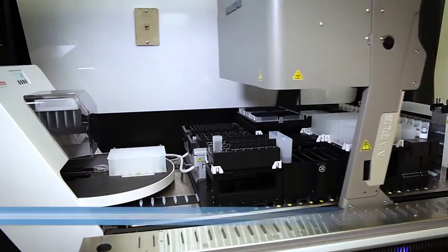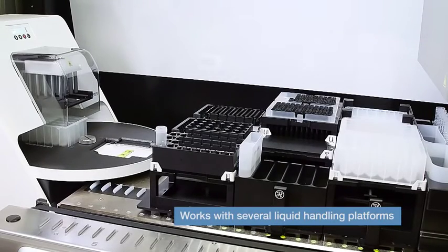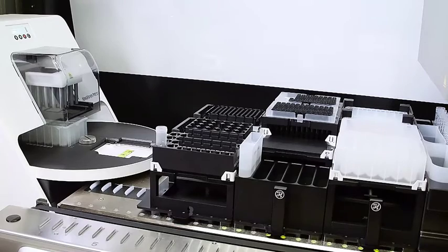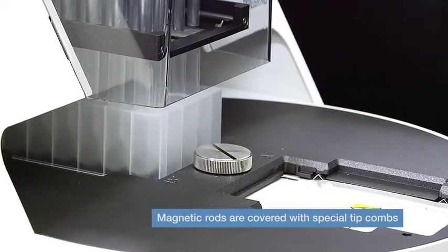Using the Hamilton Nimbus HD as an example, watch as the compact Kingfisher Presto and built-in turntable with two-plate position fit easily into an automated system.